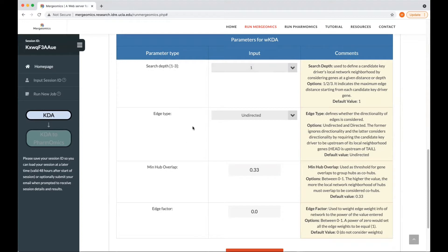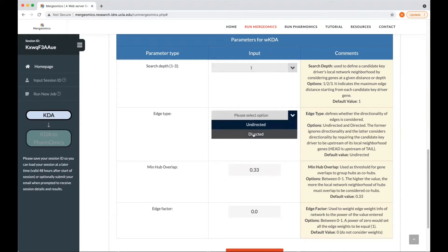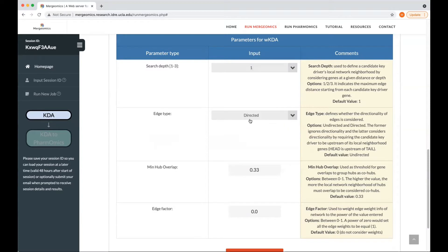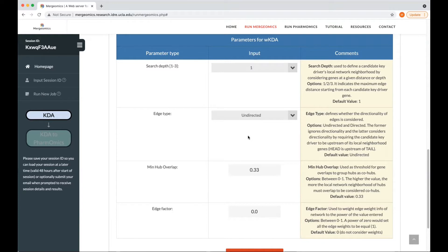Next is the edge type. And this is if you would like to consider directionality in your network. For example, if you want the key driver to be upstream of target genes, then you will select the directed option. But otherwise, you would select undirected if you're not interested in directionality.